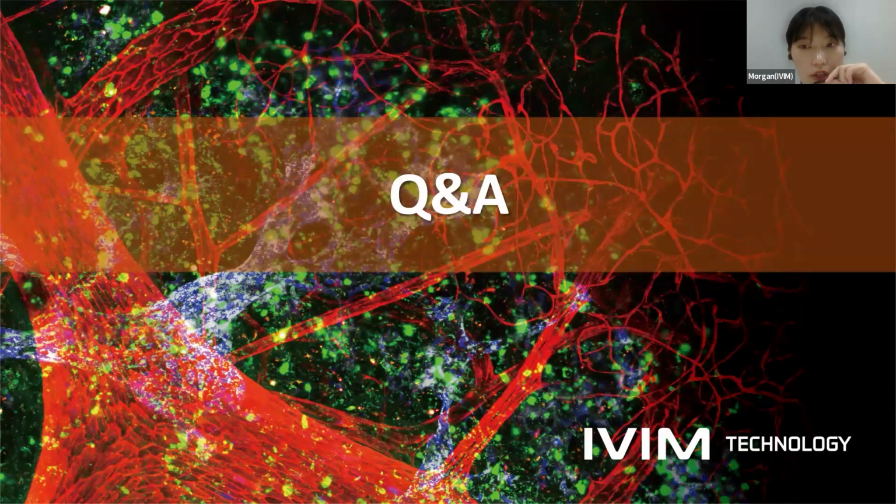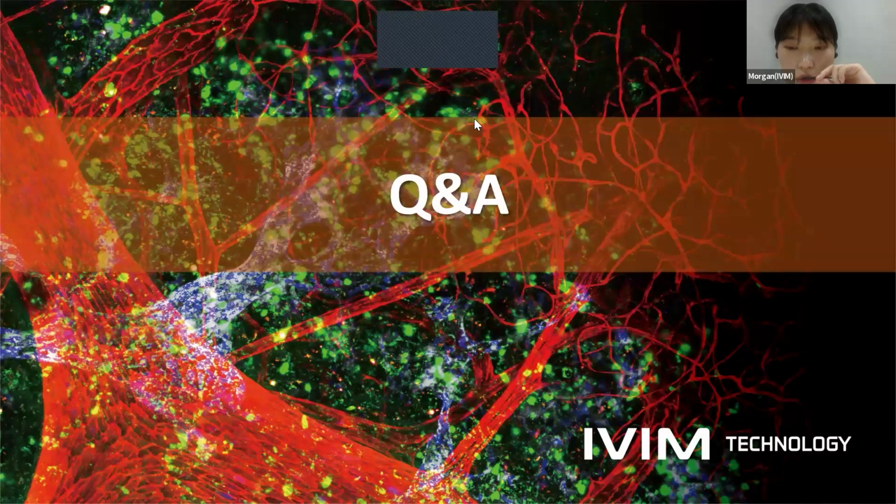So our first question is, hello, thank you for the webinar. Our lab uses both mice and rats. Do we need to purchase two separate systems to perform intravital imaging on both animals?